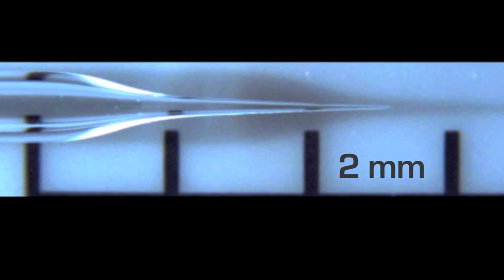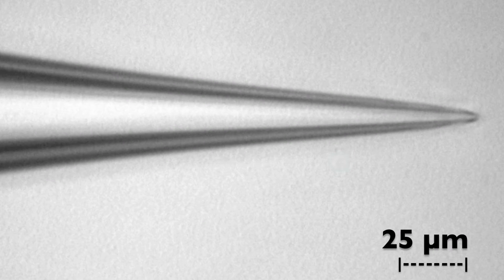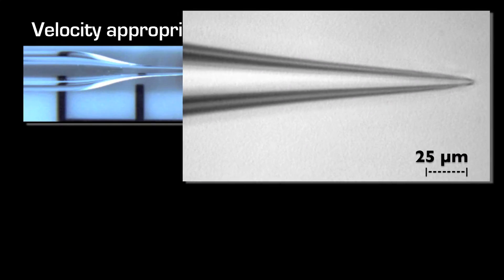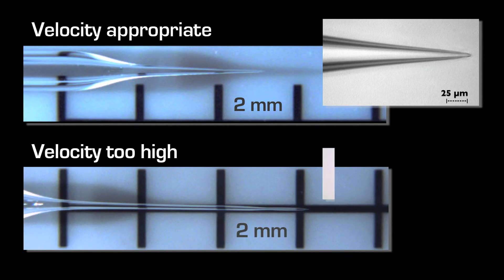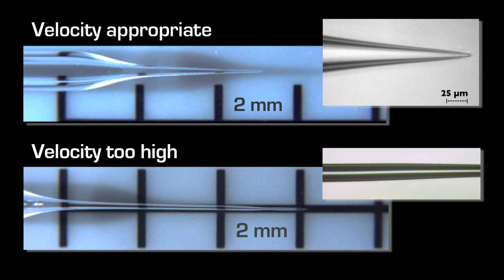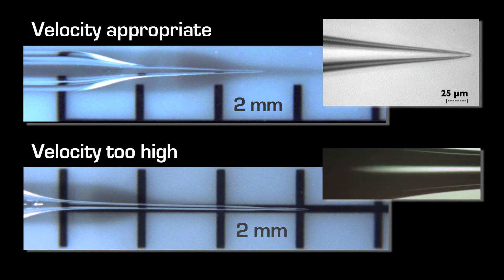An important factor in being proficient at pulling pipettes is the ability to recognize and correctly interpret the symptoms of when a parameter has been pushed beyond its useful range for a certain type of glass. To learn this, we will take close-up looks at pipette tips pulled with appropriate parameter sets and compare them with pipettes pulled with parameters outside the reasonable range.